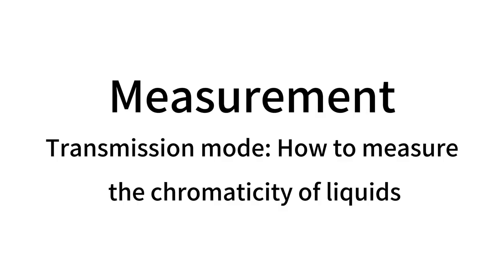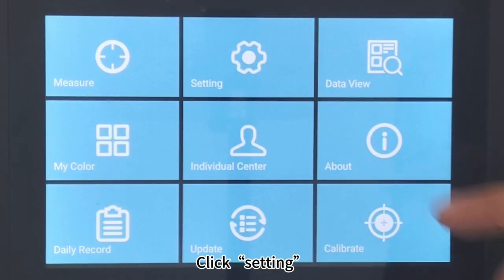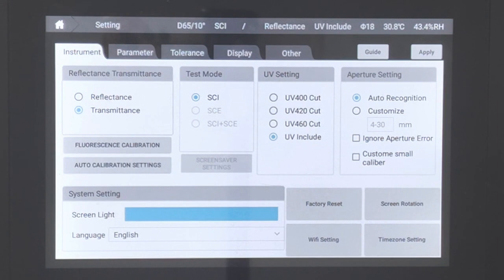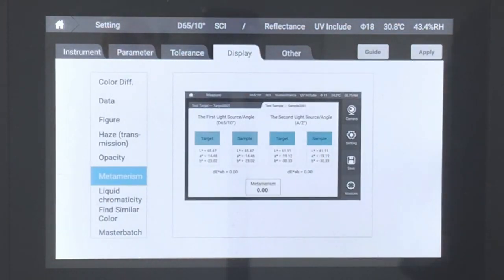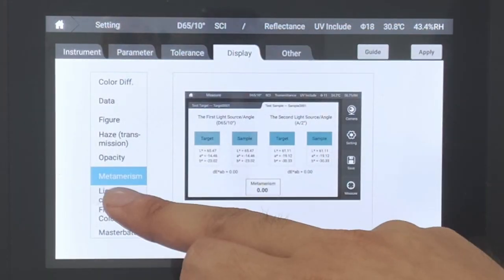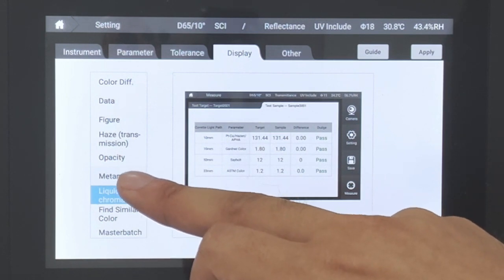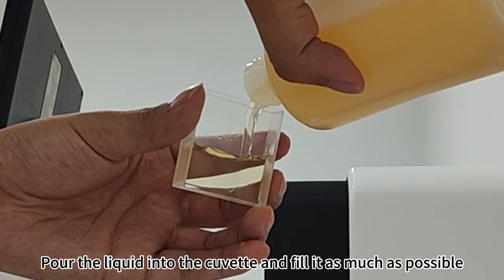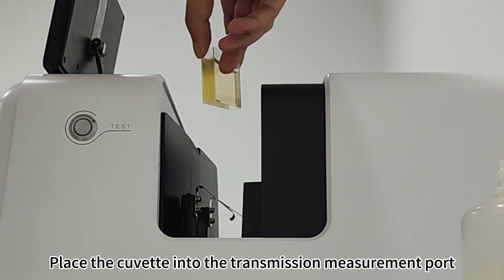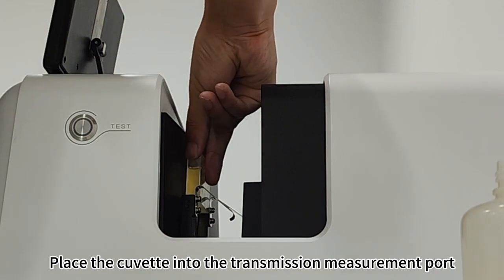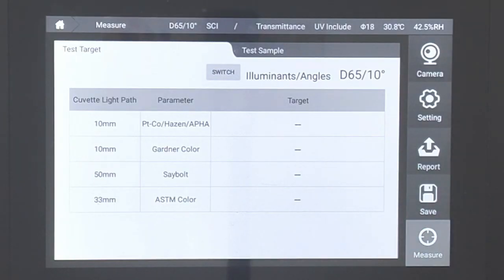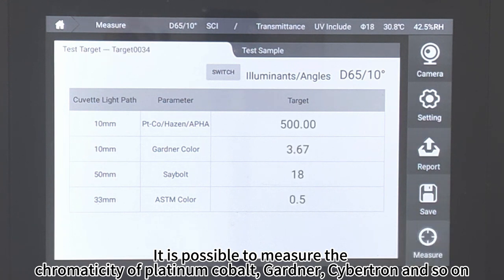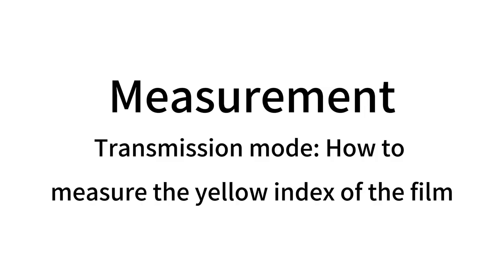Transmission Mode. How to measure the chromaticity of liquids: Click Setting, then click Transmittance. Click Display, then click on Liquid Chromaticity and click Apply. Pour the liquid into the cuvette and fill it as much as possible. Place the cuvette into the transmission measurement port and click Measure. It is possible to measure the chromaticity of platinum cobalt, Gardner, Saybolt, and so on.